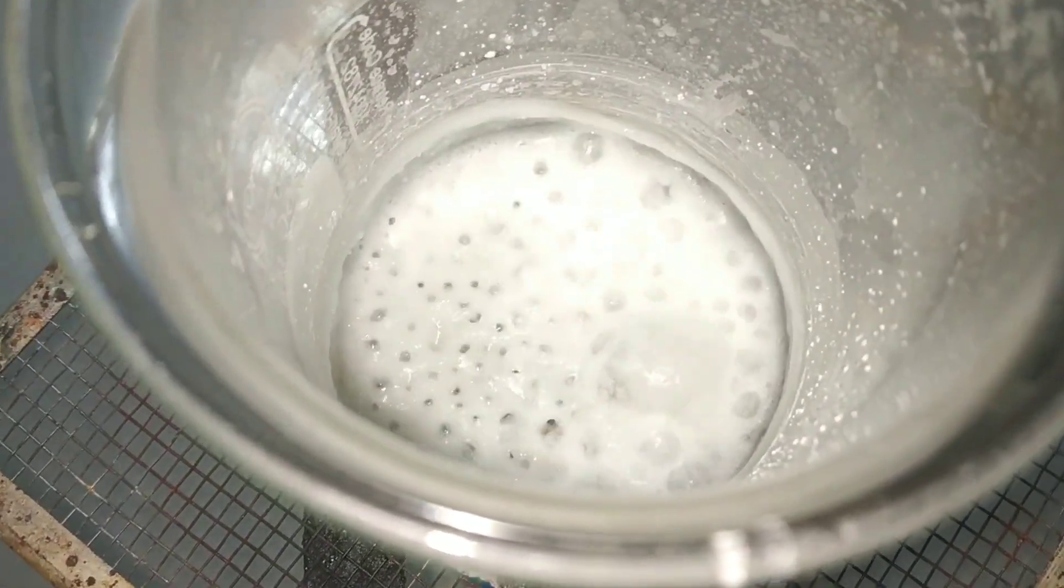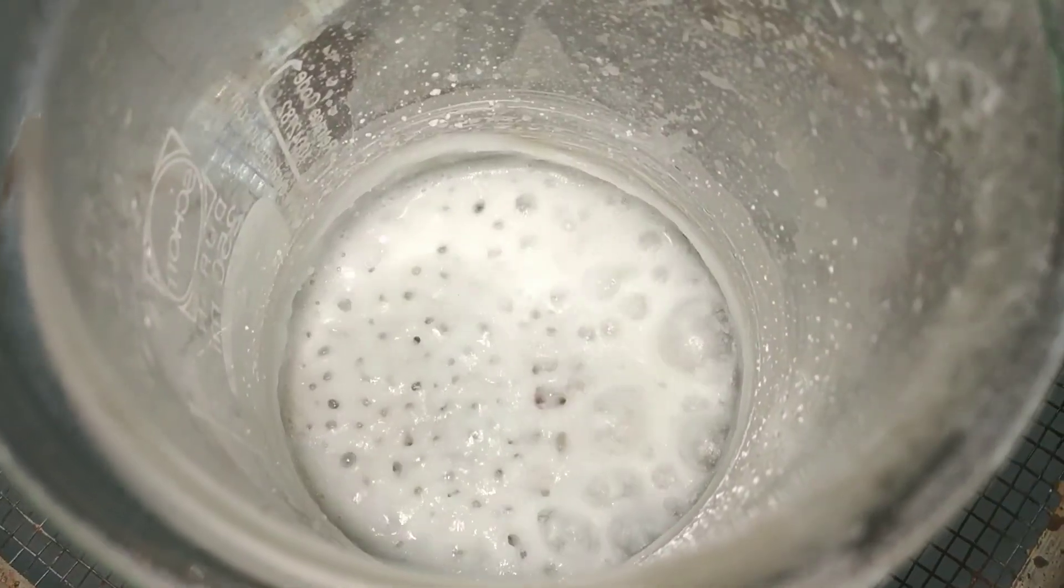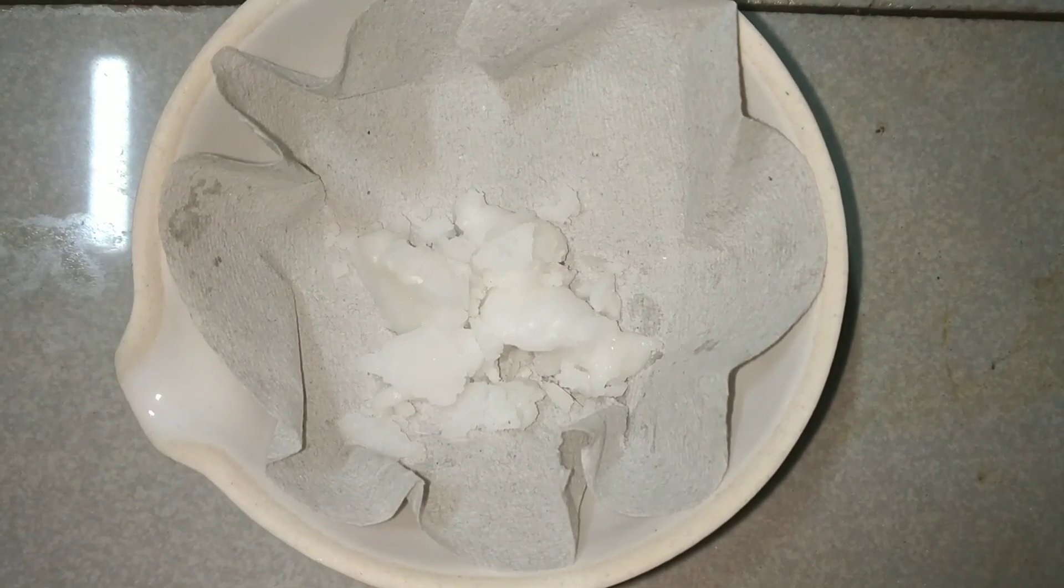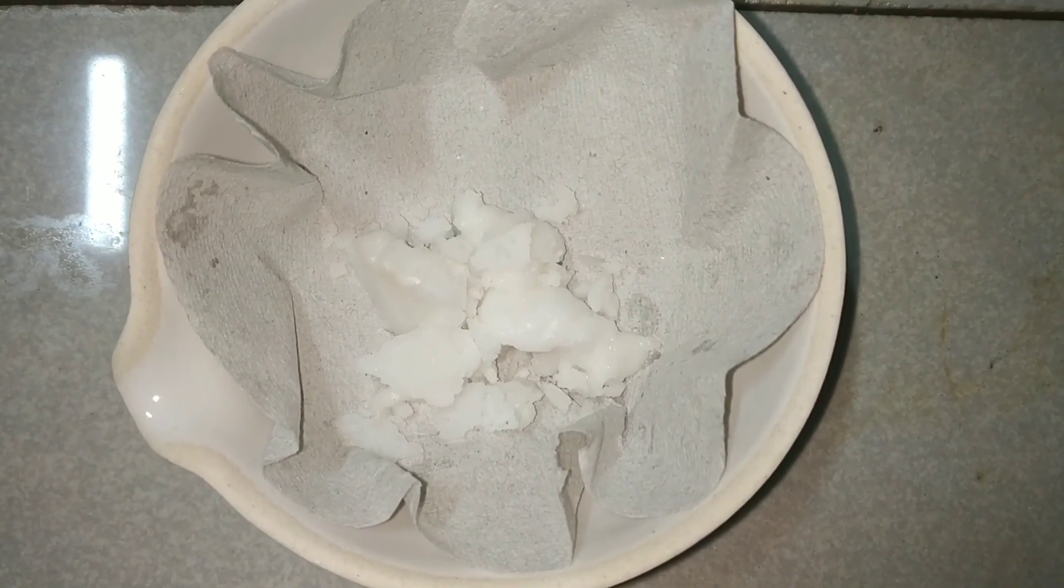Now we heat the solution to boil in order to collect the crystals. We can boil down the solution to dryness to obtain the solid product, and this is the final product, that is the disodium hydrogen phosphate.